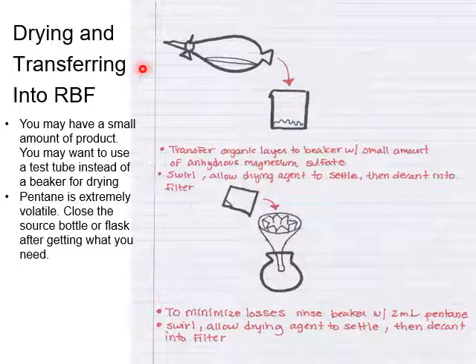Now you want to dry after the washing, and again you might want to wash several times. If you are really dedicated to this, doing it several times is way better, and it's also more efficient for your reaction because you might wash it more efficiently, right?